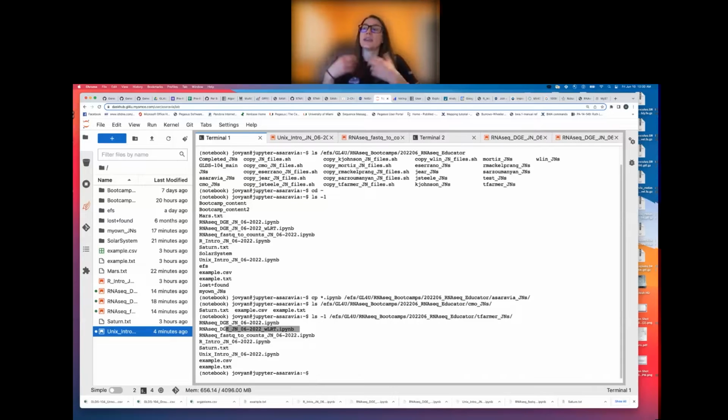And so again, if you make additional updates to the ones in your home directory, for those of you who haven't finished updating it how you wanted, you could just run this command and it'll overwrite what was in there. And that's another reason why I always like to make a new folder in my home directory, copy any Jupyter notebook that I have there before I go ahead and copy it into this location. Again, just saving a backup just in case you overwrite something and then realize that you wanted to go back. You'll always have a copy in your own home directory.